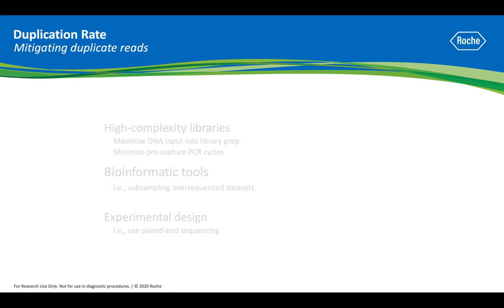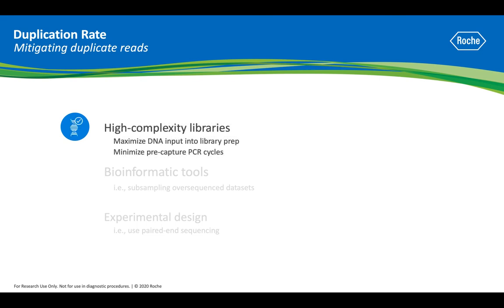There are several ways to reduce the occurrence and impact of duplicate reads. First, ensure that library complexity going into target enrichment is as high as possible. For example, maximize the amount of DNA input into library generation and minimize the number of pre-capture PCR cycles to reduce the occurrence of duplicate reads.